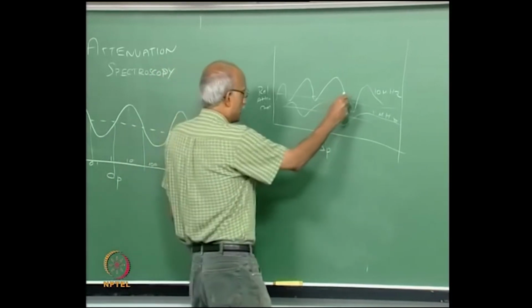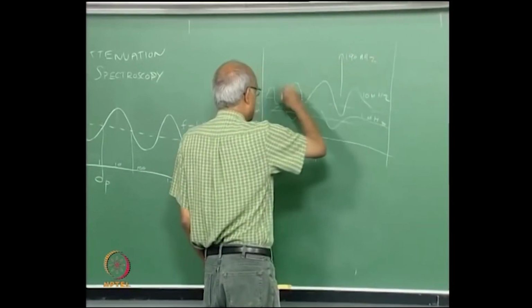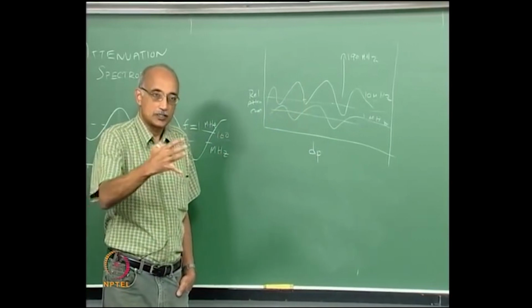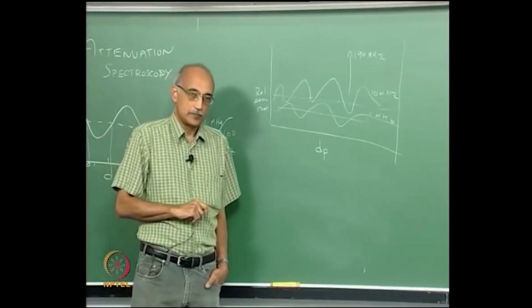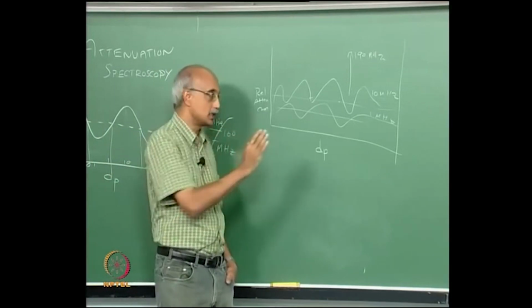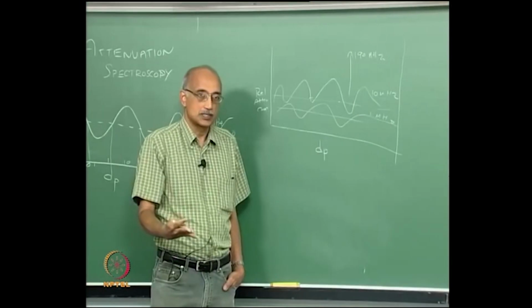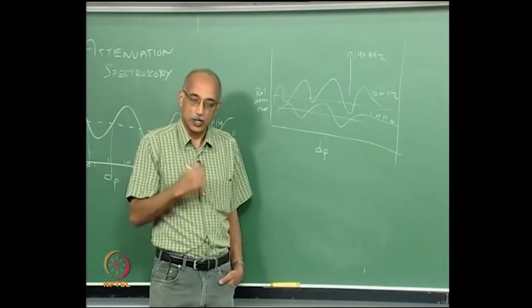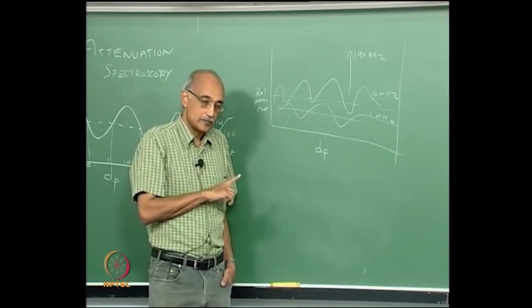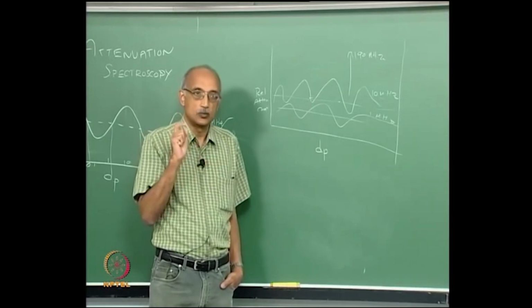As you keep increasing the number of frequencies that you test at and you keep measuring possible sizes that you obtain at these various frequencies, eventually you will identify that one unique size that is present in all these spectra, and that you decide is the actual size of the particles in your sample. Now the limitation of what I just talked about is this only works for monodispersed samples, in other words where there is only one size.